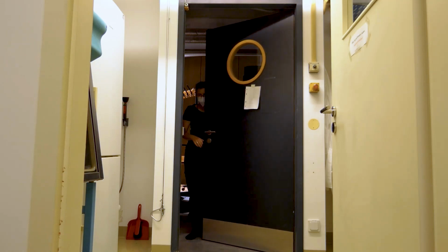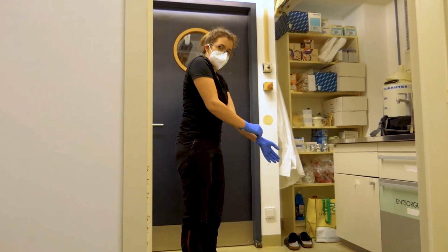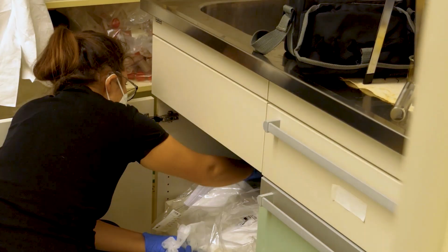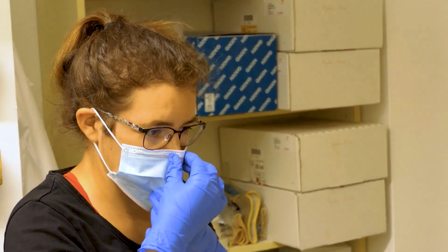A special dress code is necessary for genetic work on museum and subfossil tissue samples to minimize all kinds of possible contamination with intact DNA and PCR products. In NGS times, this is crucial for later library preparations.